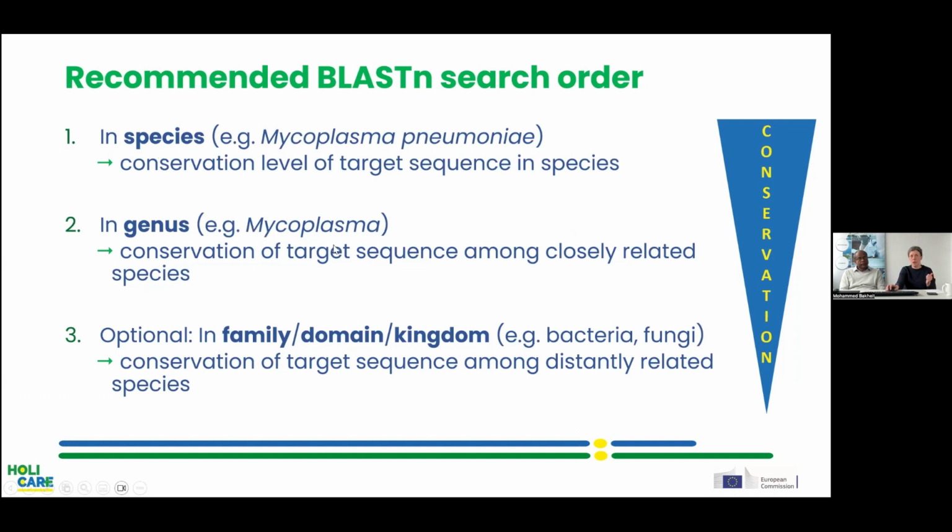So in this case, for example, in the Mycoplasma species. And therefore you should repeat the BLAST with the 16S sequence, but in the Mycoplasma group. And it's optional. You can also do further BLASTs in the family, domain, or kingdom to find out how big the differences to other species of this sequence are.